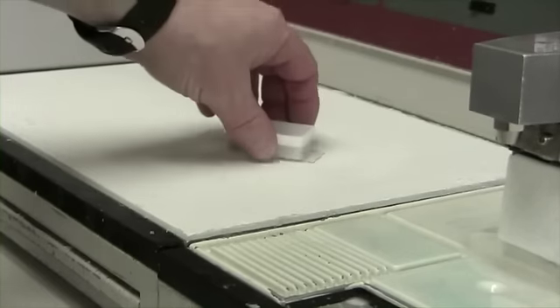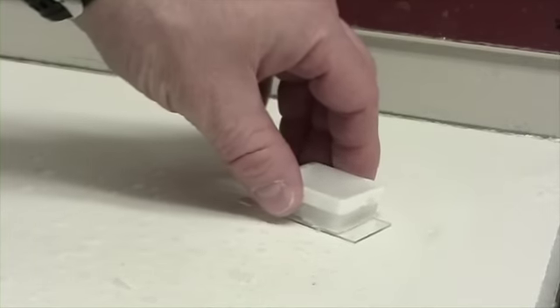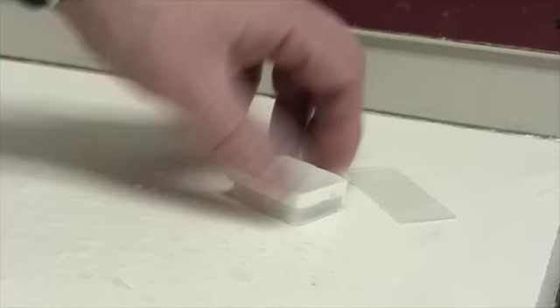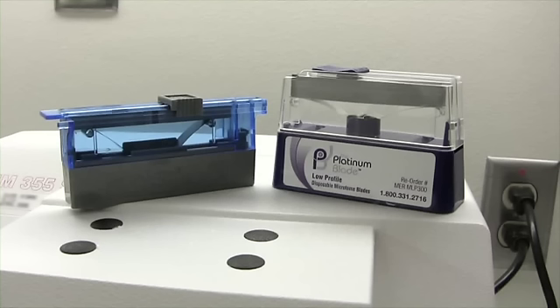Once liquefied, quickly remove the hot slide and flip the array block and the slide over on the countertop to cool at room temperature. Once at room temperature, place them together on a cold plate or ice tray for at least 15 more minutes to cool. Now the slide should come away easily from the paraffin block. Trim your edges and you're ready to cut.